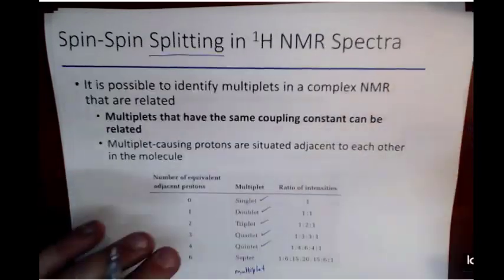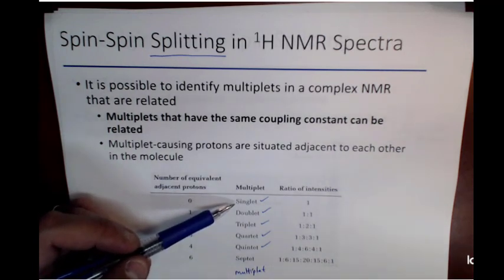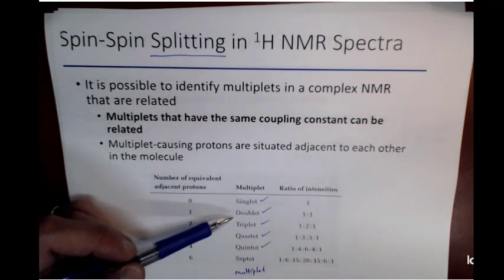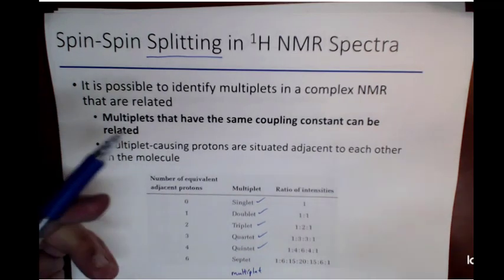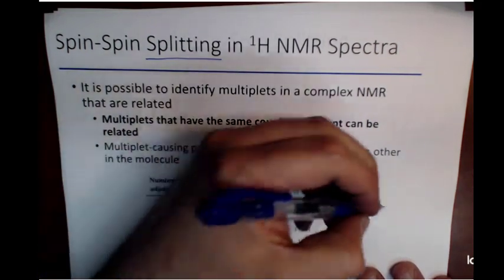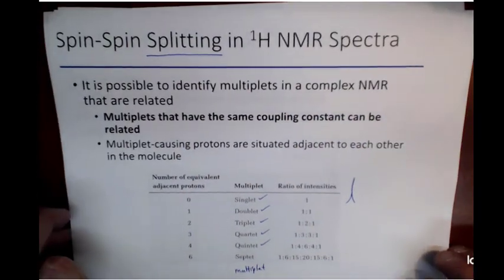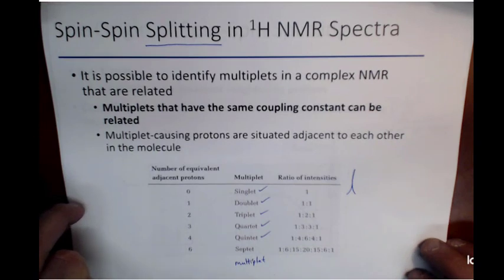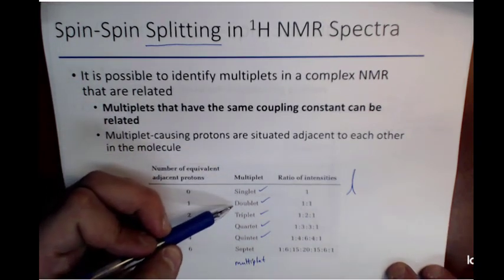All right, but what's going to wind up happening is you'll not just get singlets as signals. You'll get doublets, triplets, quartets, quintets, so on and so forth. And so a singlet, as we've seen, looks more like this, right? Forgive my artistic talent. I know it's just spectacular, and you're going to be envious of my skills.